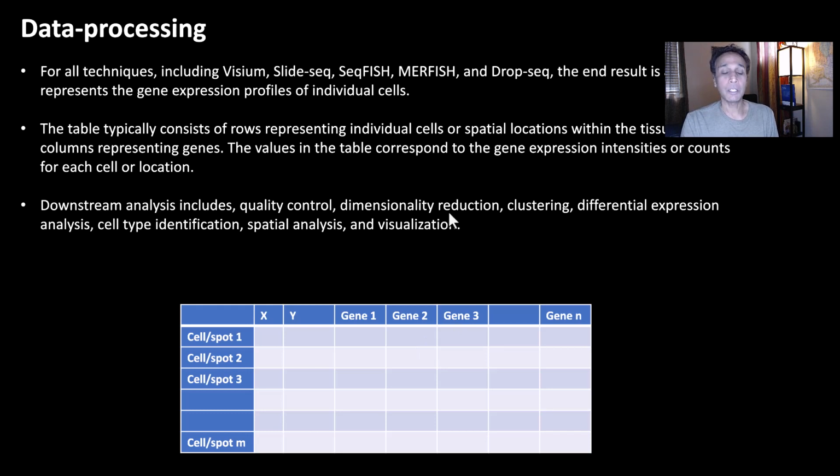For example, principal component analysis, to bring all these dimensions down to a handful of dimensions. So of all of these, what are the predominant ones? You need to understand that. So you need to change this gene information into a lower dimensional space. We'll go through that exercise in the next half an hour.